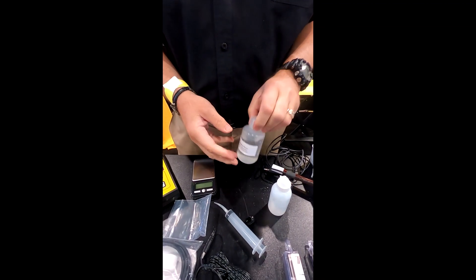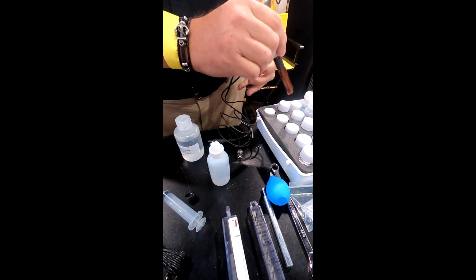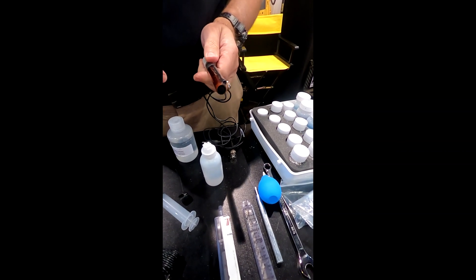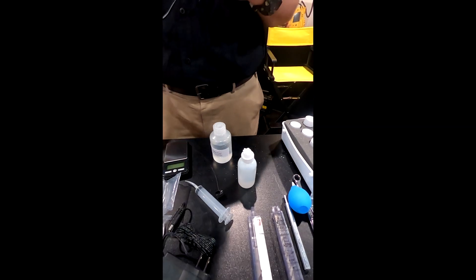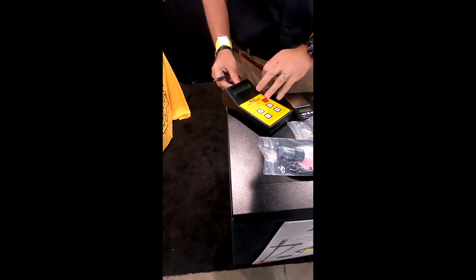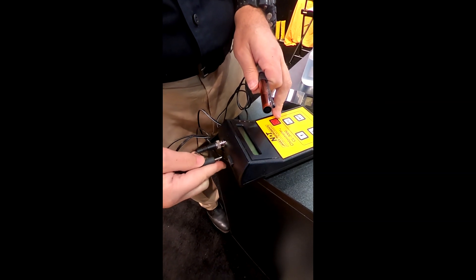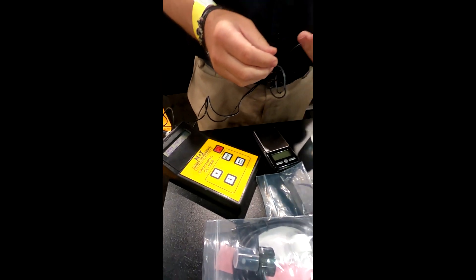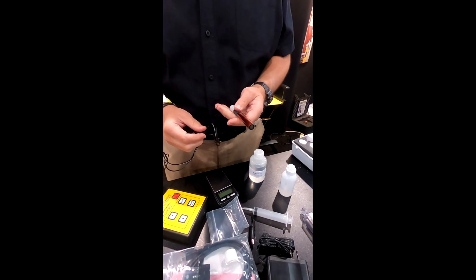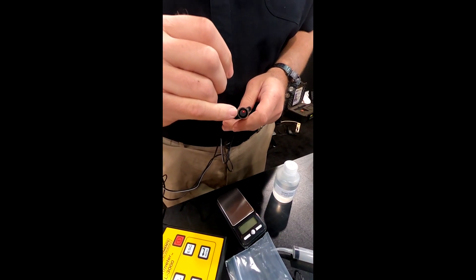The system also comes with some distilled water, though you'll realistically need more. Every time you use this electrode and place it in anything, you're going to have to wash it thoroughly with distilled water and dry it off with paper towels. Here we also need to attach the BNC connector and the three-millimeter connector. When not using this electrode, you want to keep it covered — this is a pretty sensitive sensor and you really want to keep it covered as much as possible.